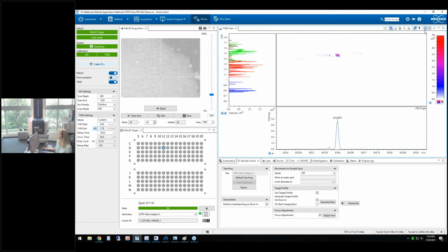And if I go to my regular MALDI spectrum, you see that the glycosylated lipid, a glycosphingolipid, disappears from my regular MALDI. Right, so this is my regular MALDI. Go to the SUM buffer. This is my MALDI 2 spectrum. So we bring qualitative additions to the spectra and to the molecules that we are able to ionize from the tissue with our MALDI 2 post-ionization.